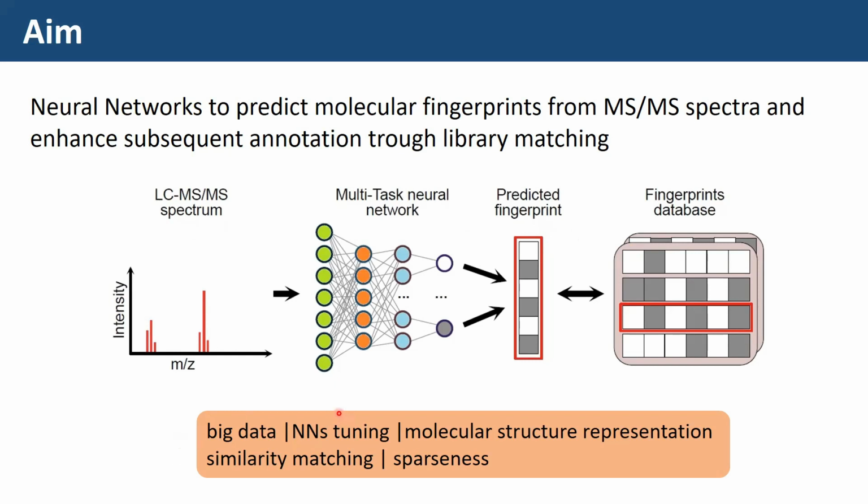With neural networks, I'm, let's say, a little bit old, I consider myself old now, and so I wasn't used to playing a lot with neural networks, but using these approaches implies a lot of tuning. And then you have a lot of opportunities to evaluate the similarity between the fingerprint and the fingerprint databases you have online.